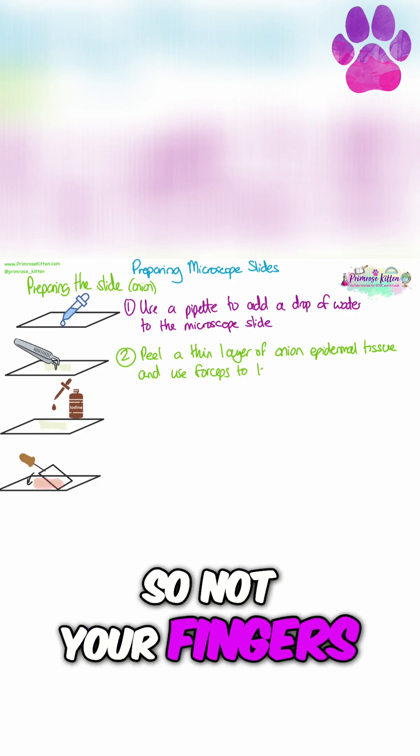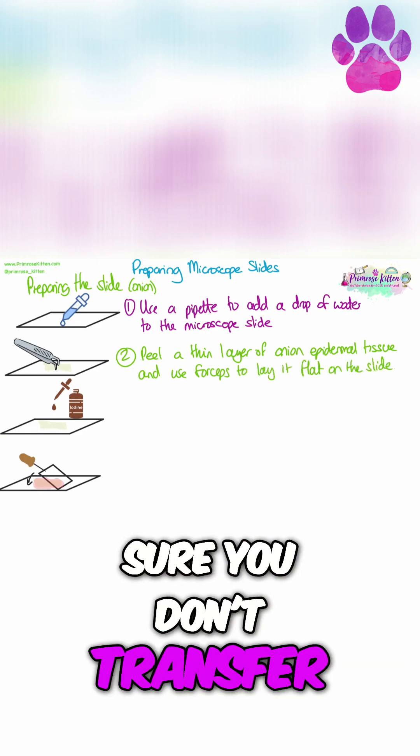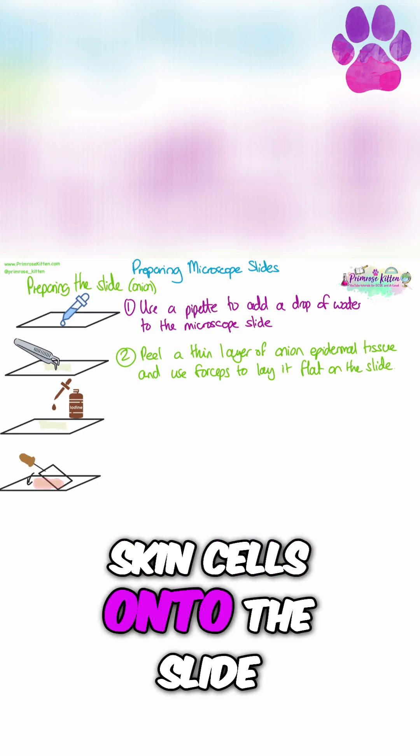You're going to use forceps, so not your fingers, in order to lay it flat onto the slide. This is to make sure you don't transfer any of your own skin cells onto the slide.